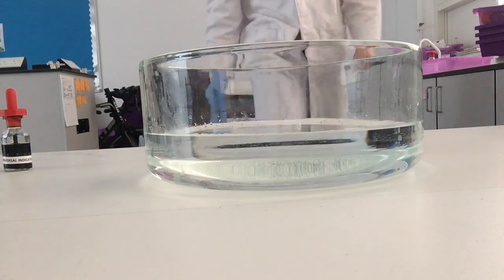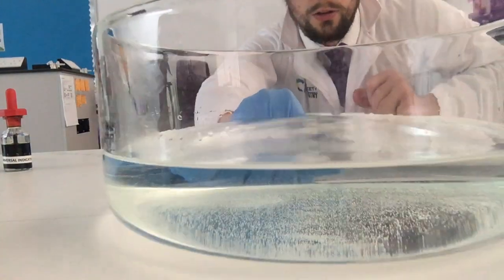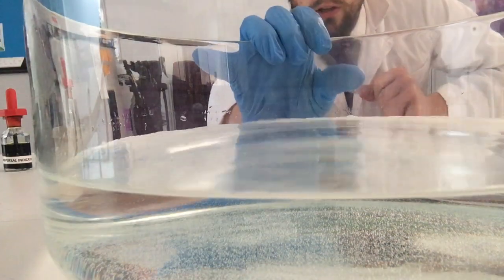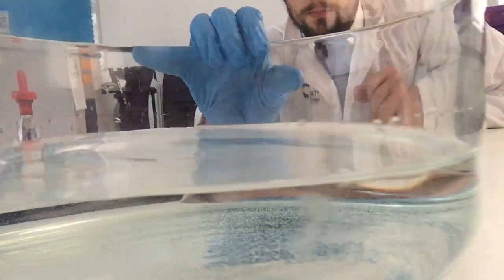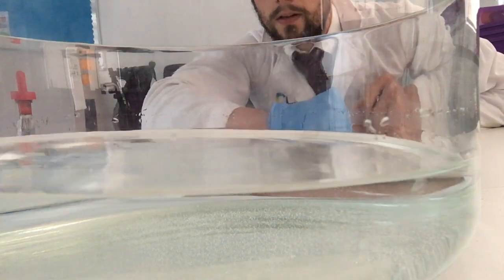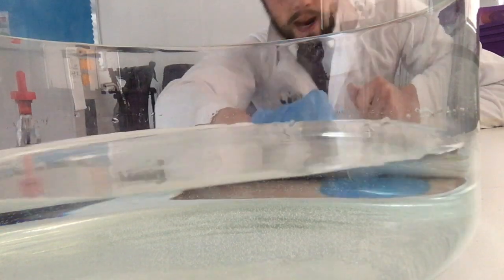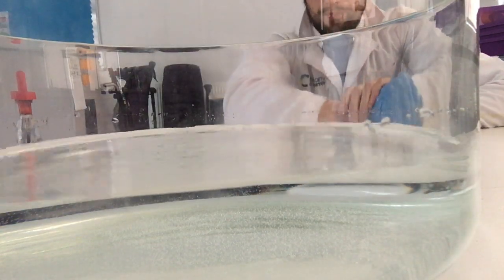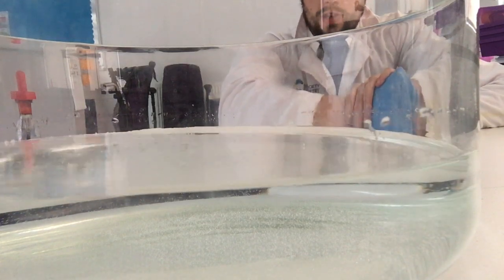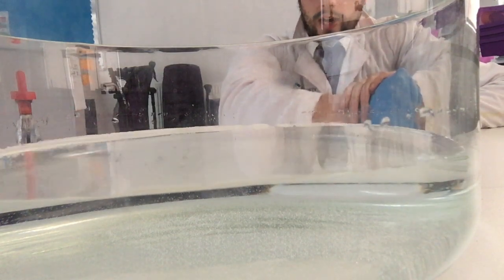I hope you can see the sodium is fizzing around on top of the water. I'll move it in close to you. It's just over here. So the sodium is reacting very violently with the water. It's fizzing around on the surface. The fizzing is because it's producing hydrogen gas. So the equation is sodium plus water makes hydrogen and sodium hydroxide.